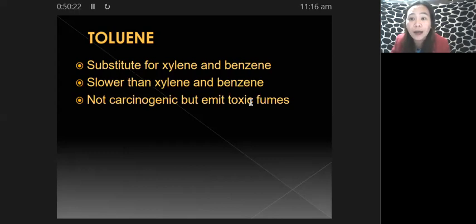Then the toluene left in your 1 liter container is only 500 ml. You have to transfer it to a container with a maximum capacity of 500 ml. Otherwise, it will acidify. That is what is meant by your toluene acidifying in partially filled vessels. So you have to store them properly.